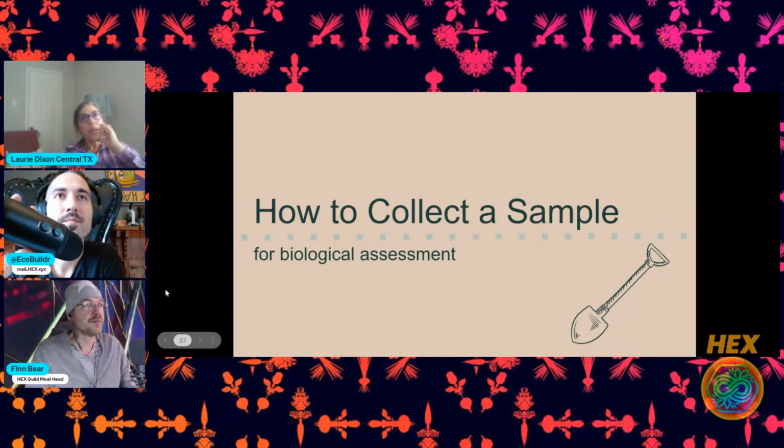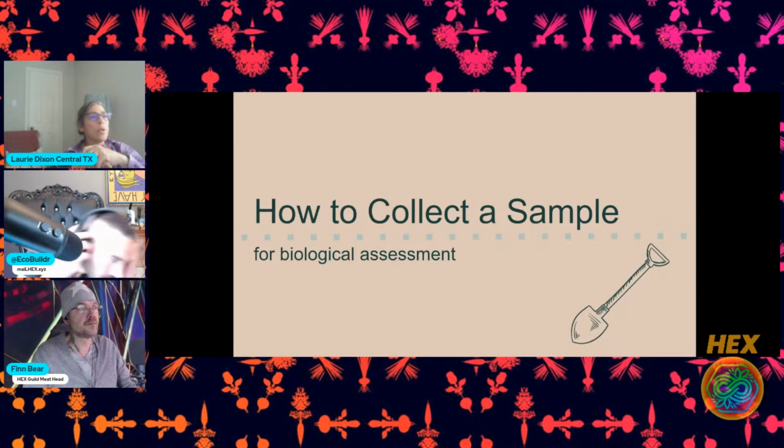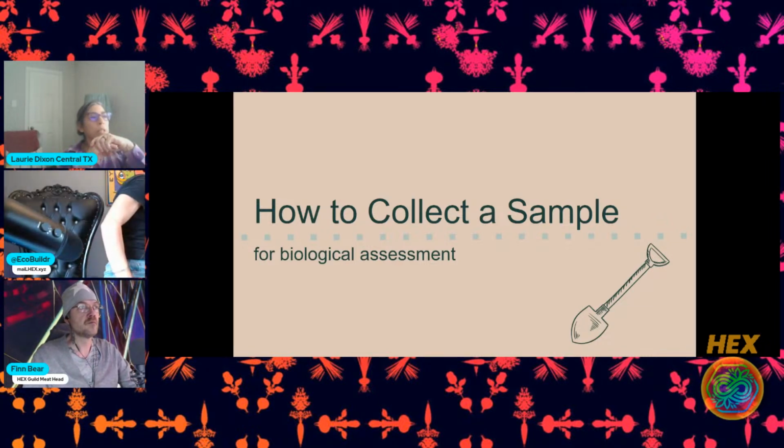Yeah, so we want at least to see 400x total magnification. That means you would need to have probably a 40x objective, and then your eyepieces can be 10x or 20x. So if you have a 10x eyepiece and a 40x objective, then your total magnification will be 400. And most of these samples are at 400.